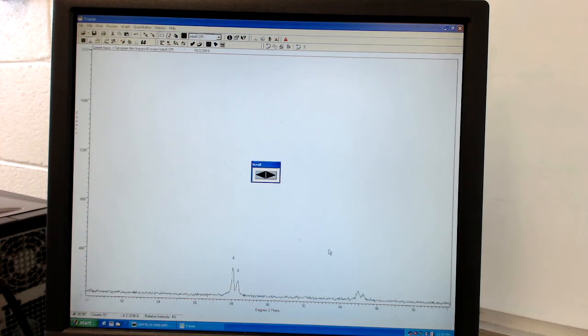I'll make them a little bigger so you can see them. And then I'll do the same thing. I'll click them to identify or to select a peak there. So I have those 2 identified. And again, if you need to delete them, you can go back up to the list. You can try to select it, but they're very hard, as you saw before.